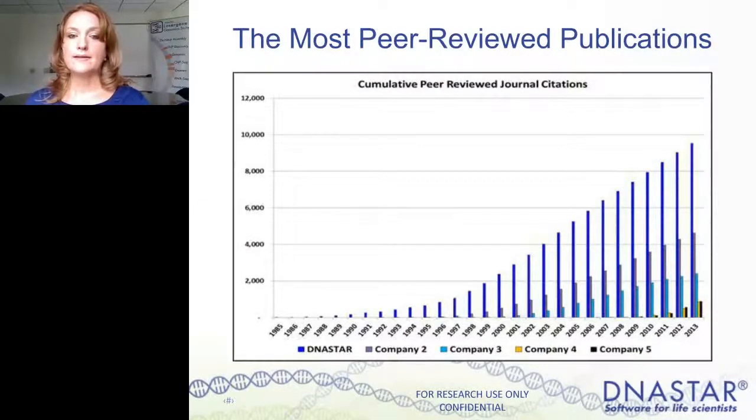DNASTAR is consistently cited more often than other software in peer-reviewed articles. We've had a tradition of this, and even up to last year, you can see that DNASTAR software is cited twice as often as even our nearest competitor in these publications.